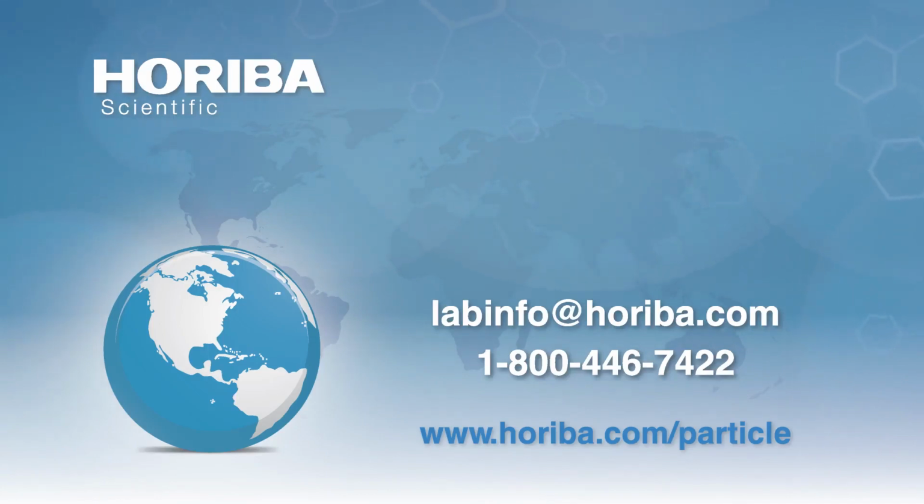So yeah, those measurements can be difficult, and also applying the field. That's why phase analysis is a lot better. I haven't gone into talking about different instruments and how they measure, etc. That's something else. But if people want to know more about it, I can certainly talk offline to them.